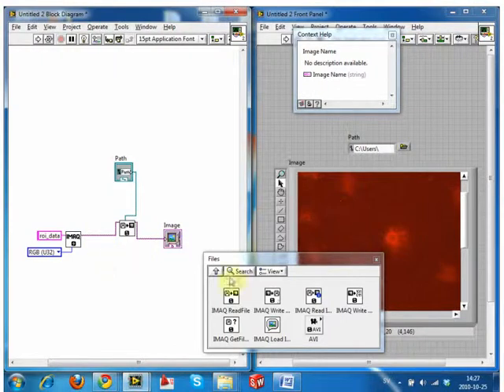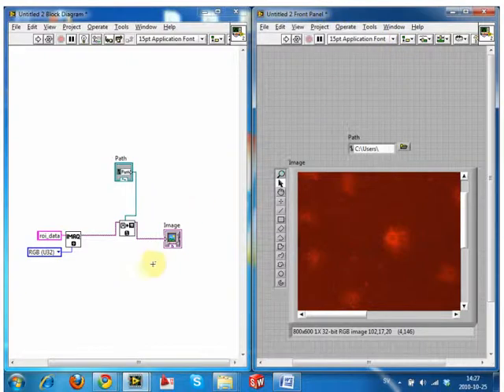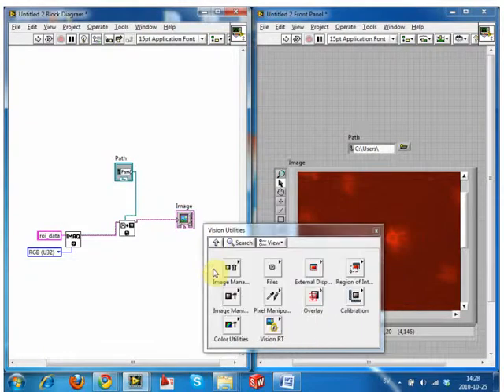So, okay. But now you could also wire it to this load thing somewhere, or I'm sorry? There's no possibility to wire it right now. To wire what? This trash thing. Yeah, so we're going to do it in a minute anyway, so we can do it now.